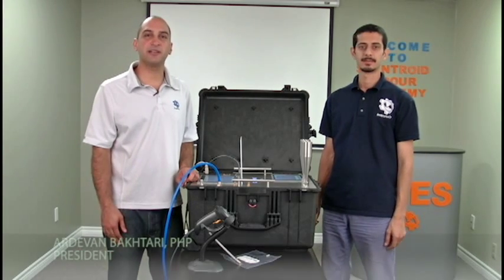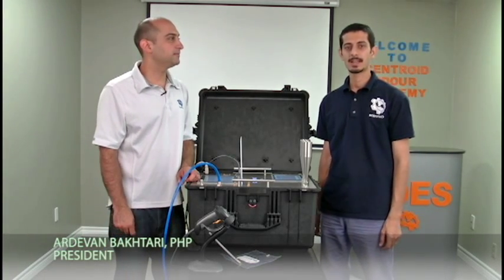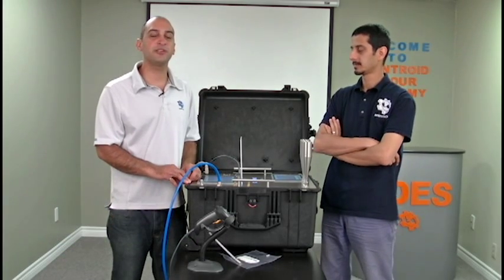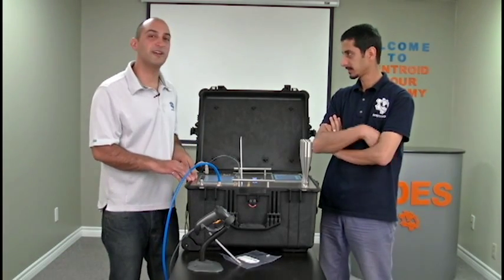Hello, this is Adam from IDIS Canada, and this is Hasan. We're here today at the Centroid Odor Academy to show you a new model of our portable olfactometer.